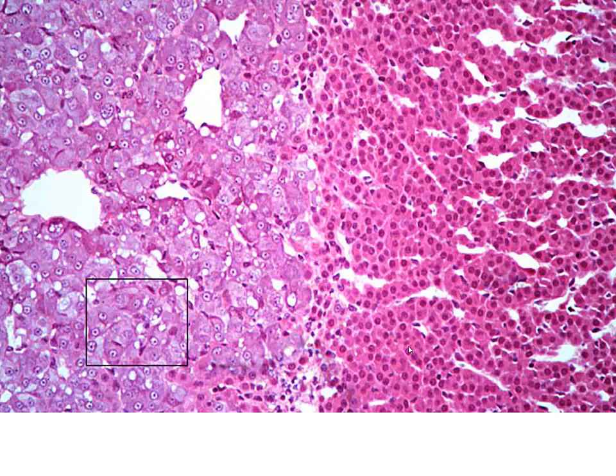So here, as we look at the third layer, we're transitioning away from cortex into medulla. We can again see the reticulated nature, this networked nature of our parenchyma, our glandular epithelial cells, and this is our zona reticularis. And then we move into this tissue, and you can see these large nuclei with a central nucleolus, very neuronal looking in nature. So we know that this chorded nature, if you didn't know better, almost looks a little bit hepatic, like a liver. That's how I like to think of it, but still distinctly different from that. And if we move into this tissue, then you know we're looking at adrenal cortex, reticularis, versus a medulla.